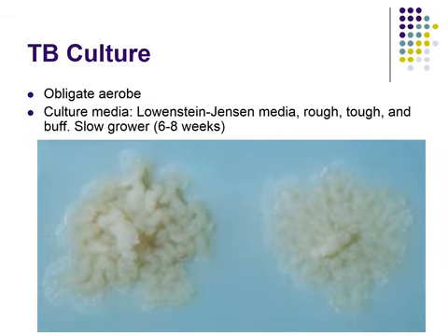So this is a TB culture on special media, Lowenstein-Jensen media: rough, tough, and buff bacterial colonies, non-pigmented.